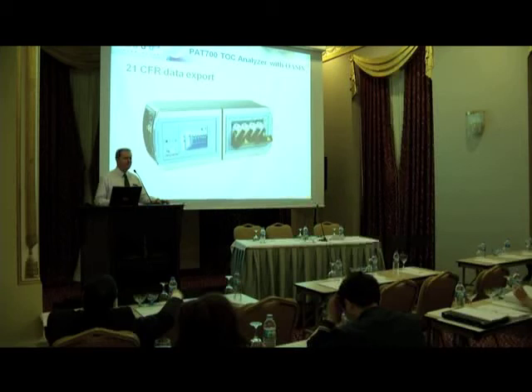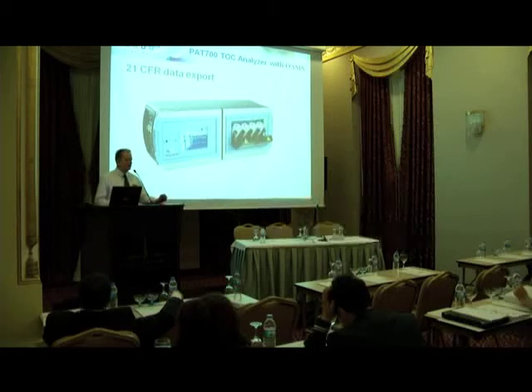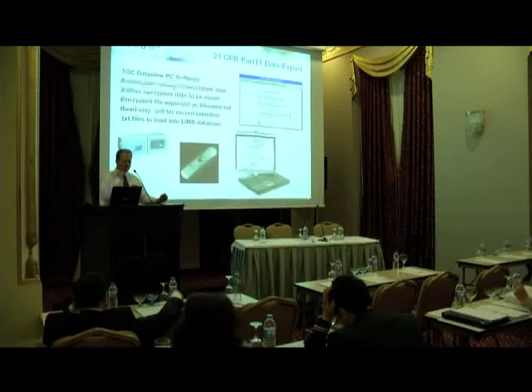The analyzer itself has an internal memory. To allow us to comply with the rules for data integrity, you can export the data onto a memory stick, but it's done in a secure manner. So the data is encrypted.